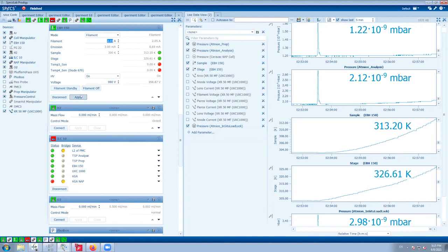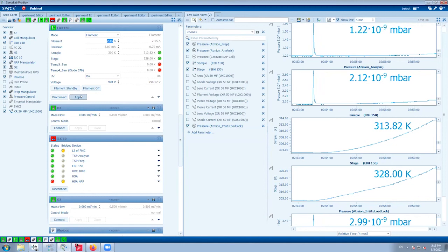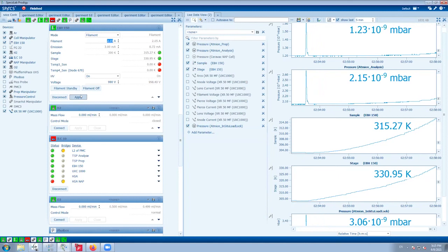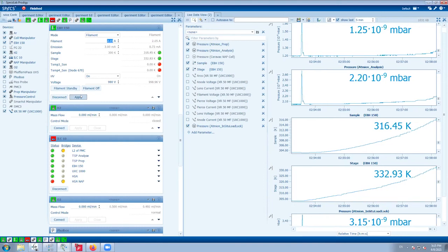Okay, one question. You showed in your talks that it's possible to measure the current in an electrochemical cell, where you have a sample in solution. But for example, as I asked you, if you remember, we have a film in a field effect transistor configuration, and we have three contacts: gate, source, and drain. Is it possible to do some kind of current measurement while adsorbing the gas?